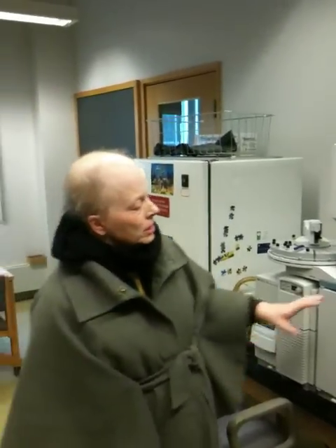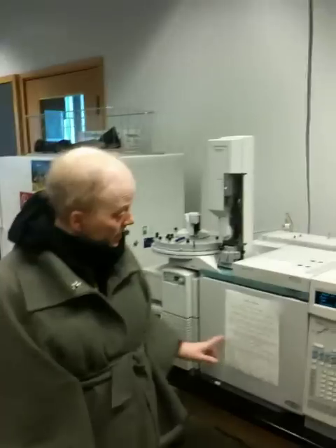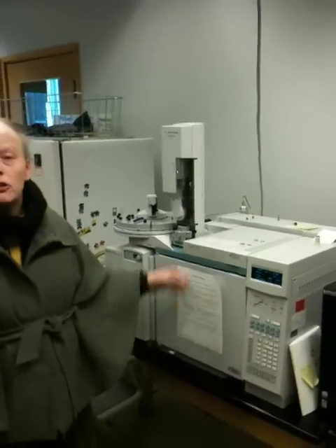The fact that it's very long is going to enable you to separate compounds that are much closer in structure, and this could include isomers and even, in one case this semester, stereoisomers. So this is a big oven, it's got a column in it, and you just have to shoot your sample into that column.